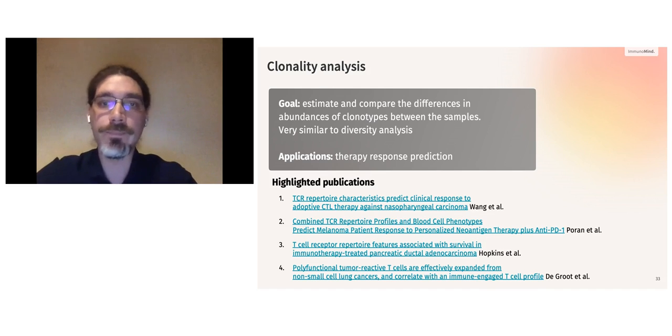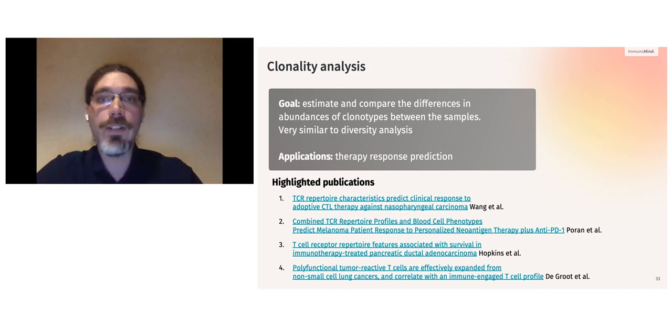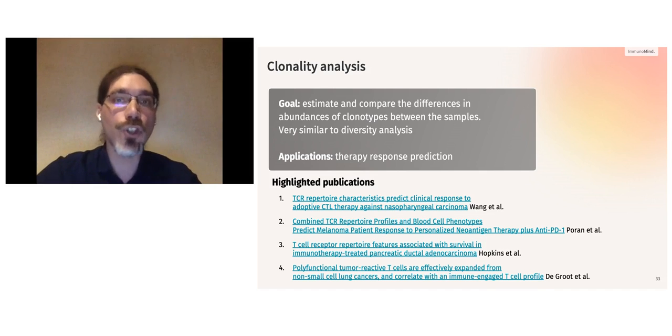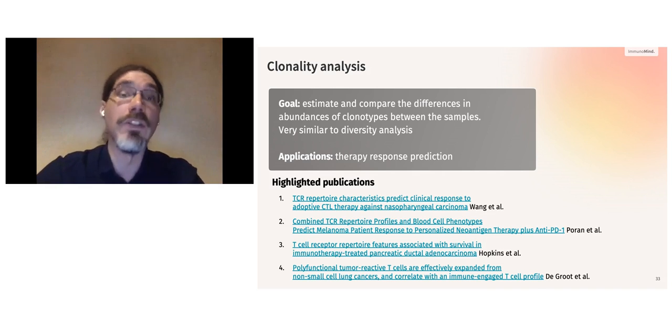The diversity comes from ecological and microbiome studies, where researchers are required to count the number of unique species in the environment. So these are different from clonality methods. They are focused more on estimating the true number of clonotypes in immune repertoires in samples, right?